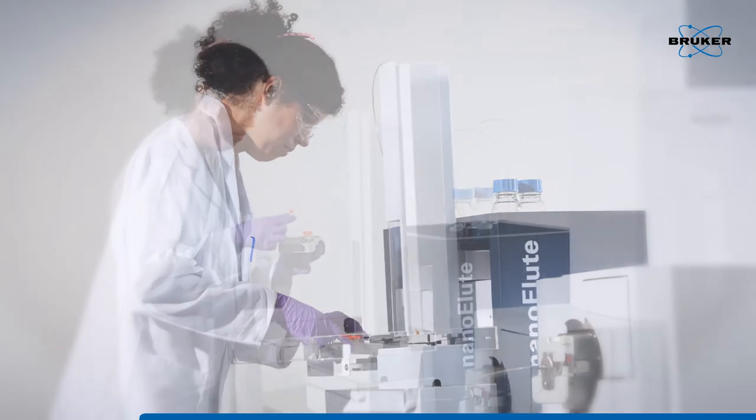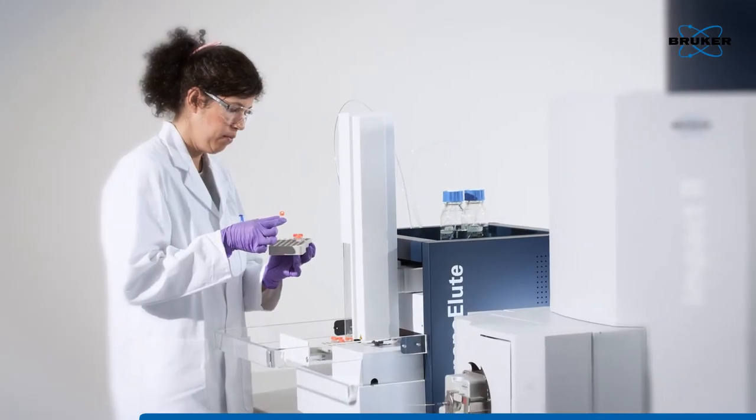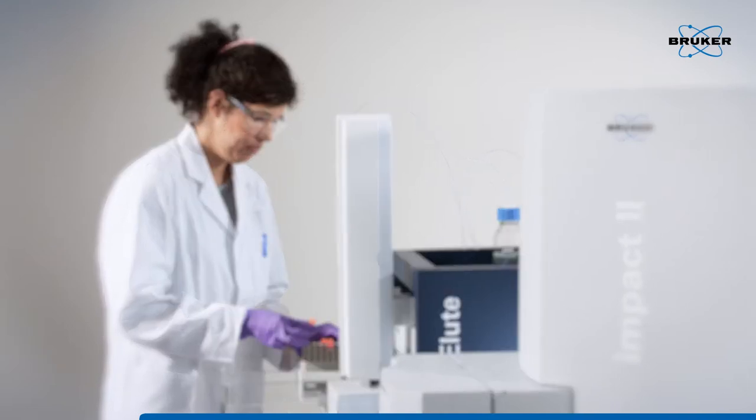LC-MS experts and biologists alike require trouble-free operation and ease of use along with top performance.